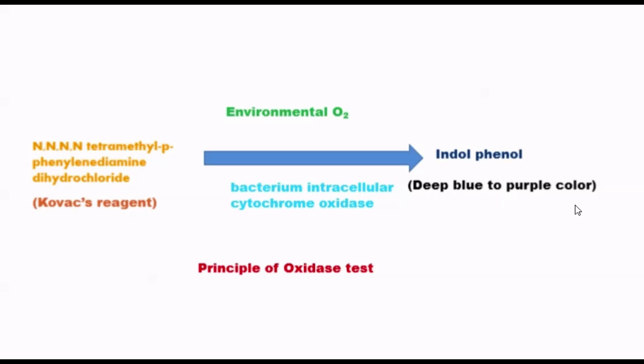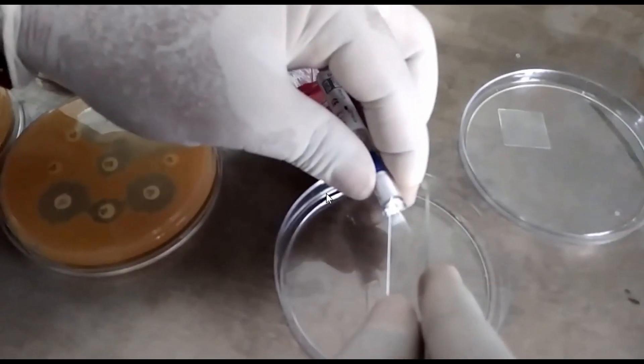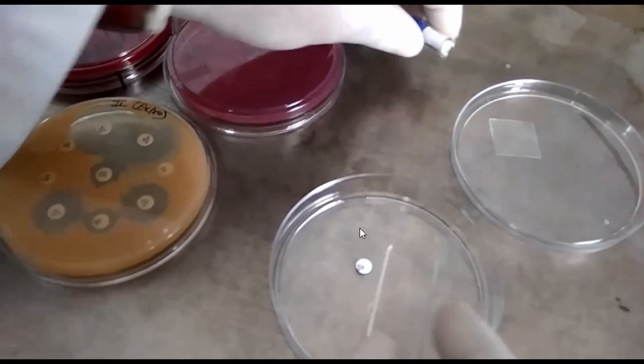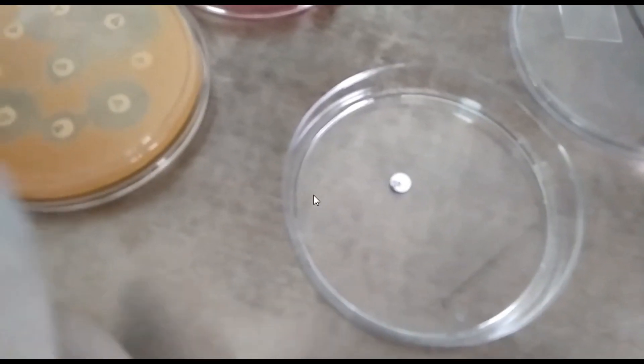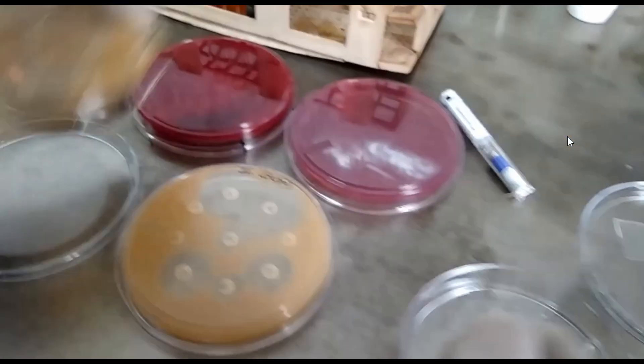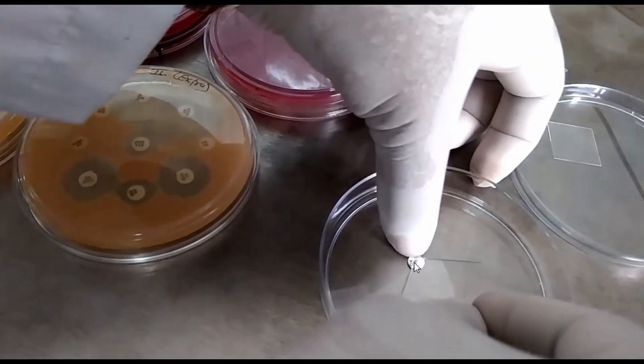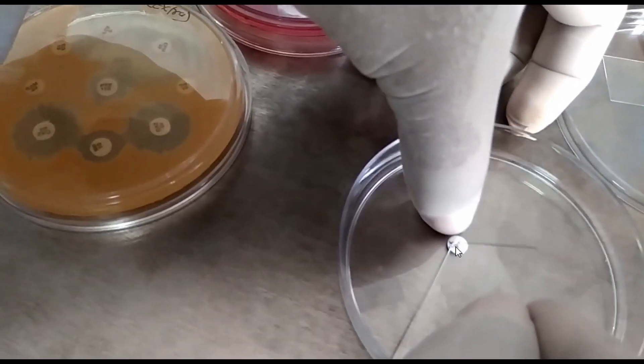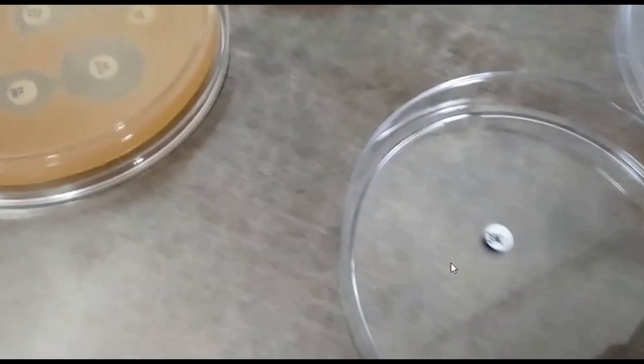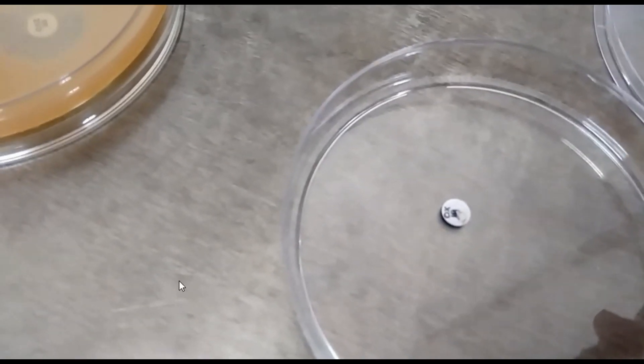Now about procedure. Just touch the colony and slightly smear over this disc in this way.